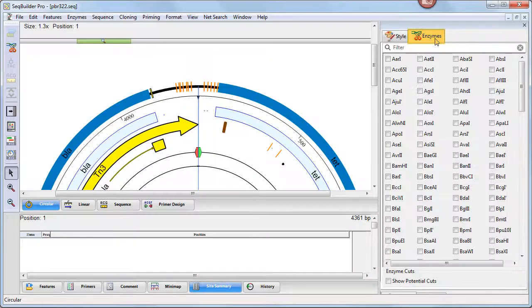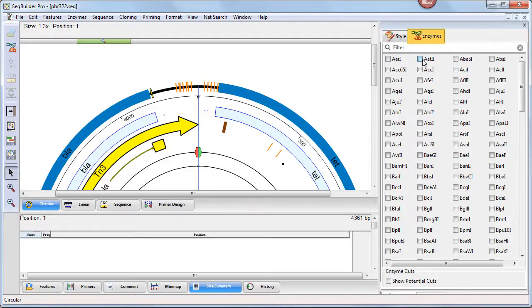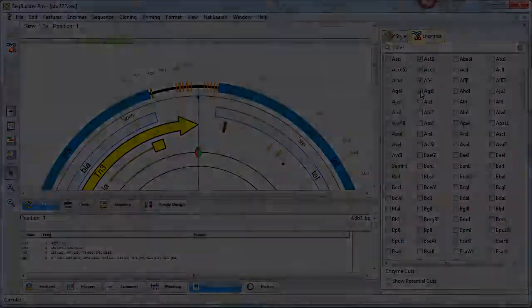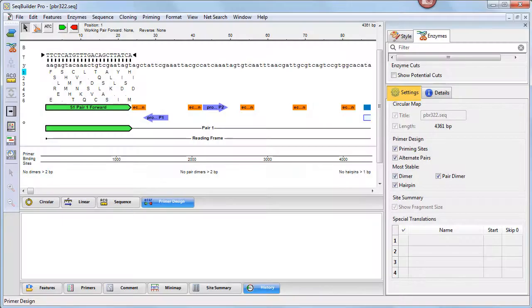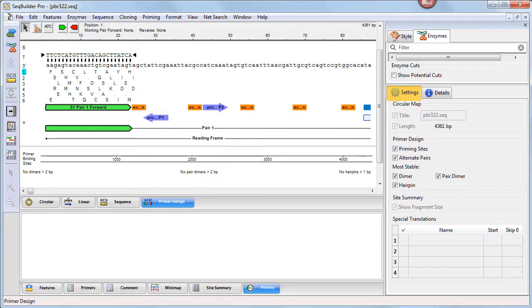The Enzymes panel lets you choose individual enzymes to display or hide in graphical views in the document window. The Settings panel lets you display or hide various components of some of the views on the left.